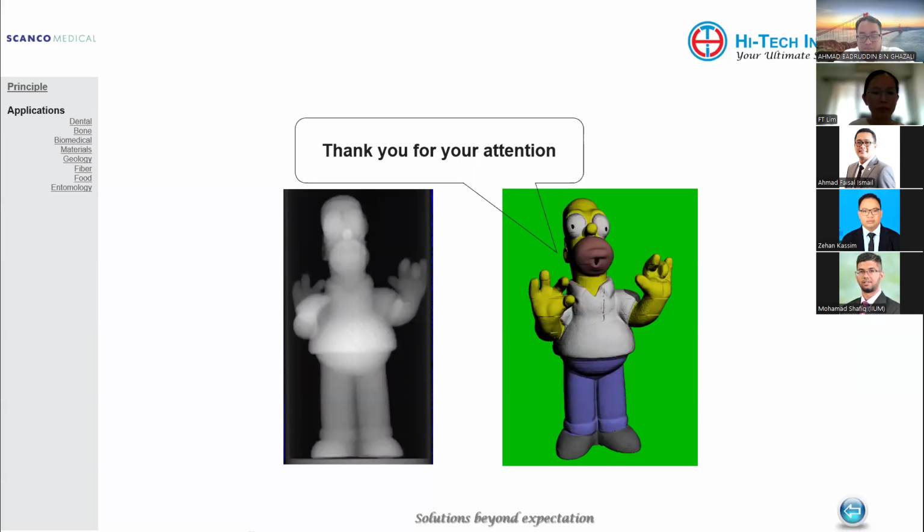Just to give some insight from our side, from dental radiology, we have our CBCT that currently can do up to 50 micron. Our kV is around 90, the maximum now is 120 kilovolt, but the mA is only up to 15 mA. So even if you scan at 50, we cannot get the same quality as your MicroCT. And I noticed that even for your implant image, there's no beam hardening artifact from the implant.